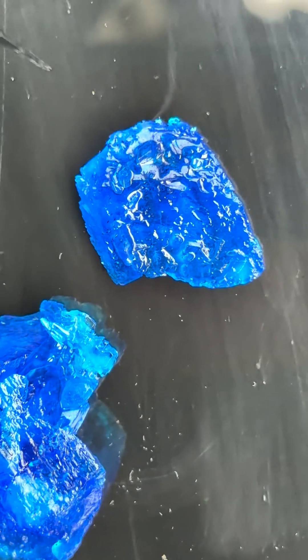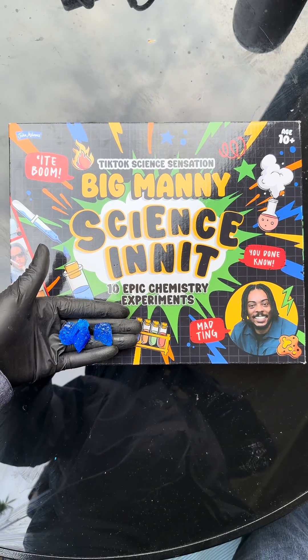Obviously, we want to remove the excess water in that so we can get the pure crystals, fam. It's a mad ting. Once all the water's evaporated, you're just left with the pure blue crystals in that, fam. Copper sulfate ting. Science, innit? We out here, fam.